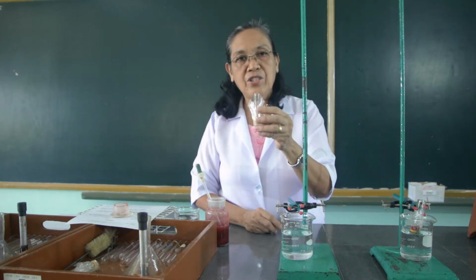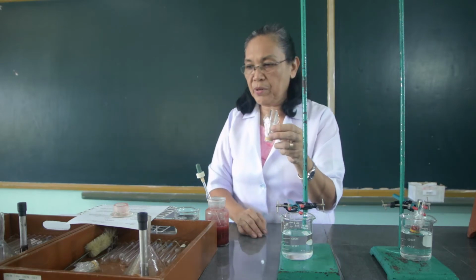To the second dialysis tube, let us put this with the potassium chromate.